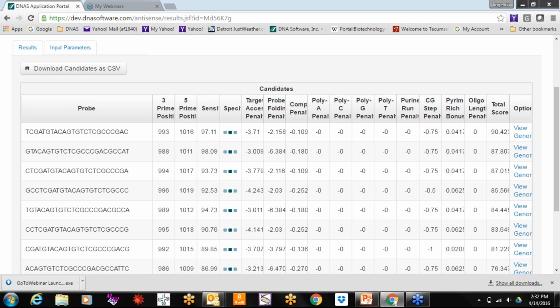So one of the main issues in antisense technologies is off-target effects. If you have a lot of guanosines in a row, or if it's built with a lot of GAs, things like that, tandem repeats, then you could easily start to affect many of the off-target effects that we're trying to avoid.